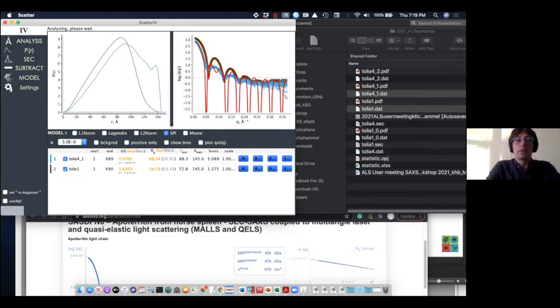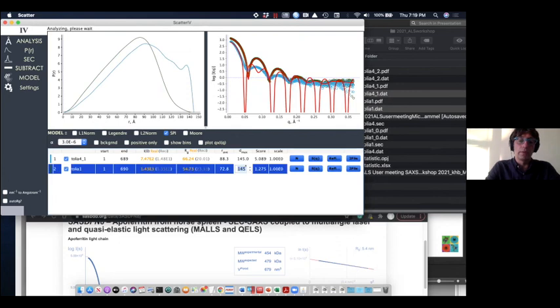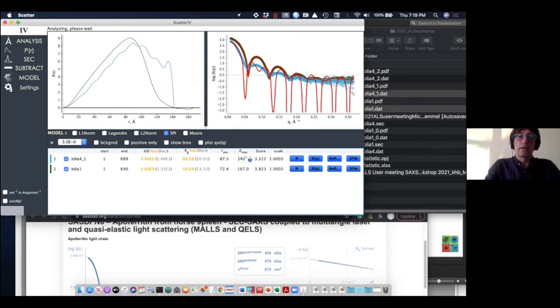Okay, so what I want to show to a user, what I will do as a main point of interest. First of all, we show that across the peak, it seems it's very stable.